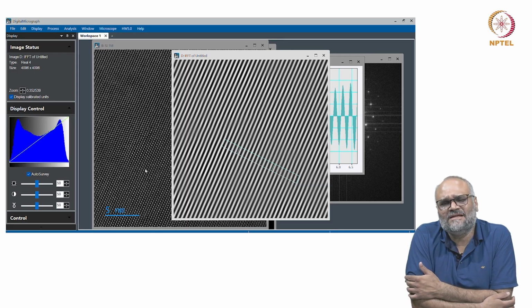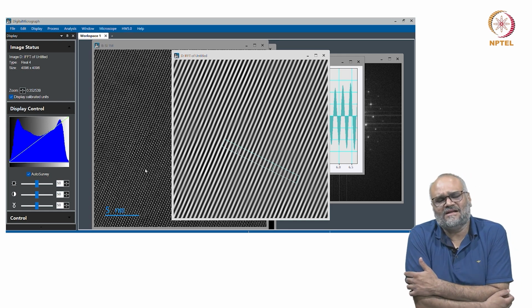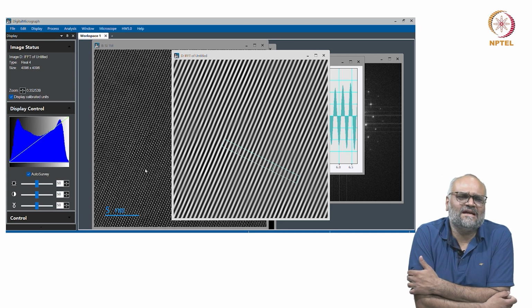Don't go with a single measurement, and just don't go with heights of peaks and assume that the numbers you are measuring are actually accurate. You can compare the anticipated actual lattice spacing versus the statistically measured value, and you can do statistical analysis and get some percentage error.